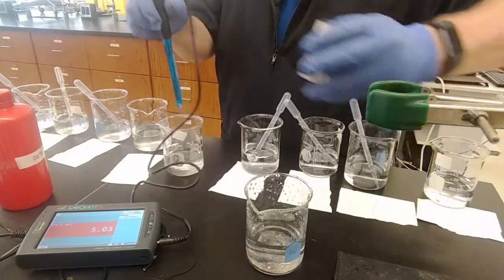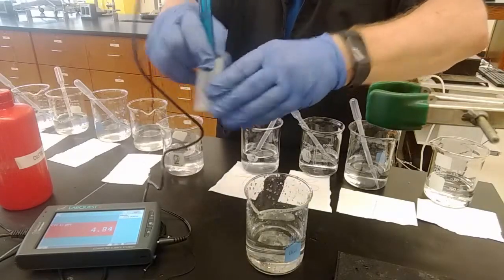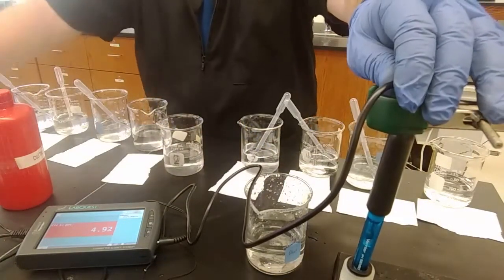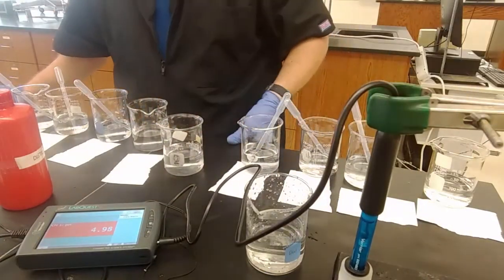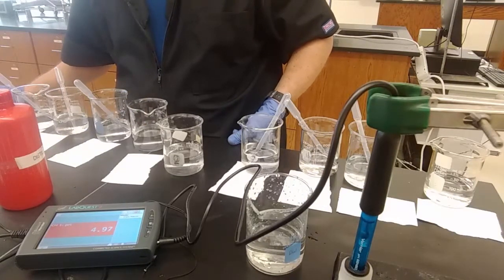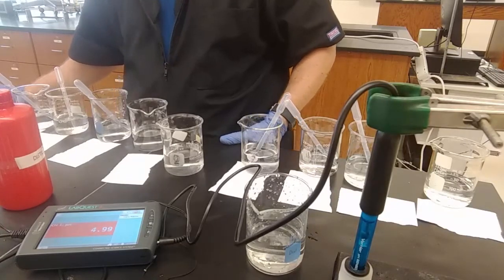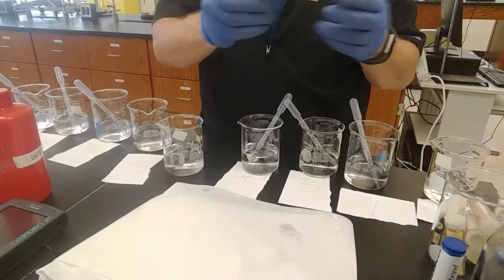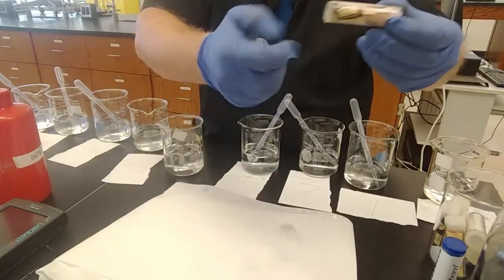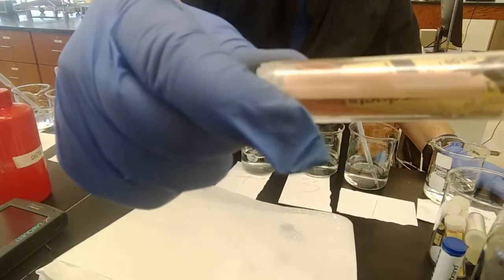All right, to recap it, I just put it back in the buffer bottle and tighten the cap, and I'm done with the pH meter. And we'll move on to measuring the pH of these 9 beakers via the litmus paper and the universal pH strip paper and the Yamada's universal indicator. We're going to go old school and use litmus paper. This is blue litmus paper, and this is, as you can probably tell from inside it, because the label is all messed up, red litmus paper.